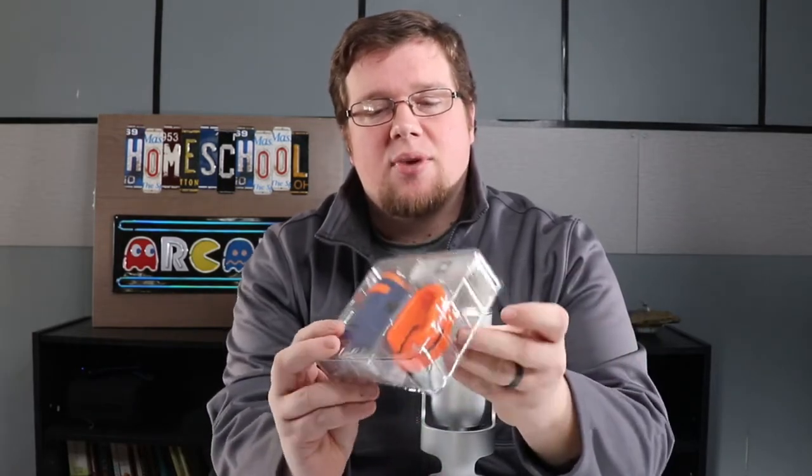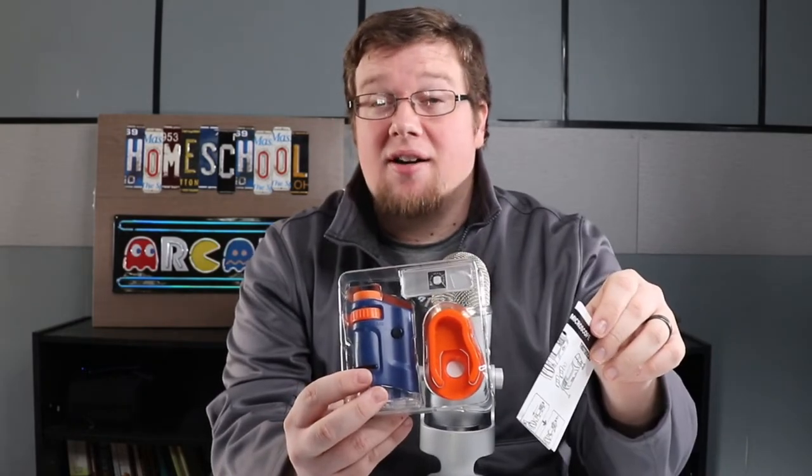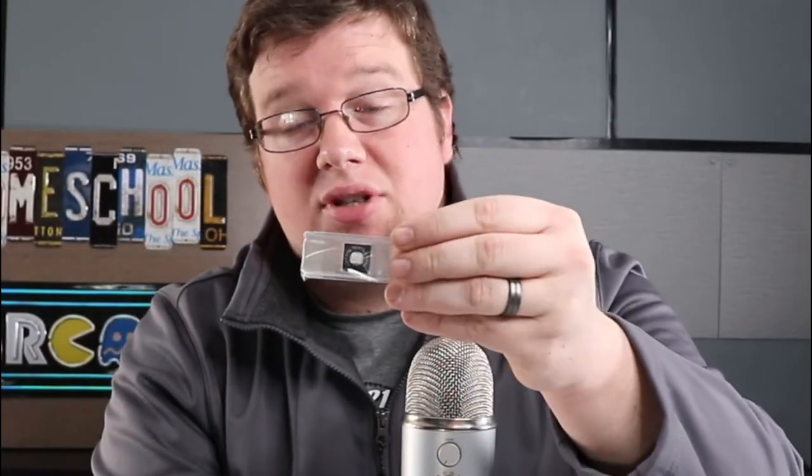Right off the bat we have our instruction manual. The batteries are actually included, which is nice. Here we have our slides — it looks like the slide that comes included is a bit of cotton textile for you to take a close look at, as well as a blank slide for you to make your own.